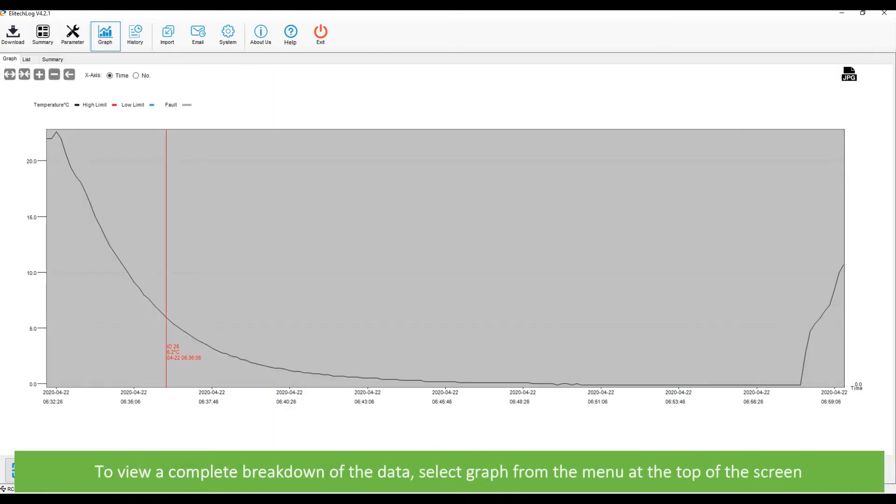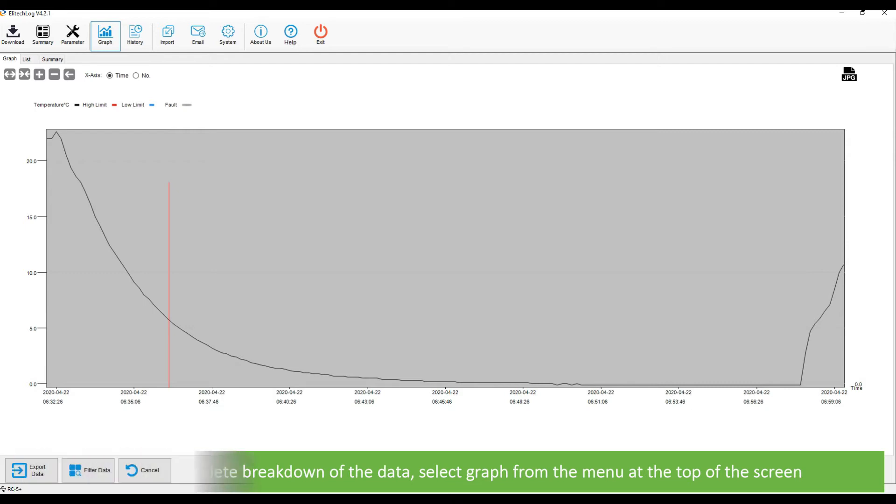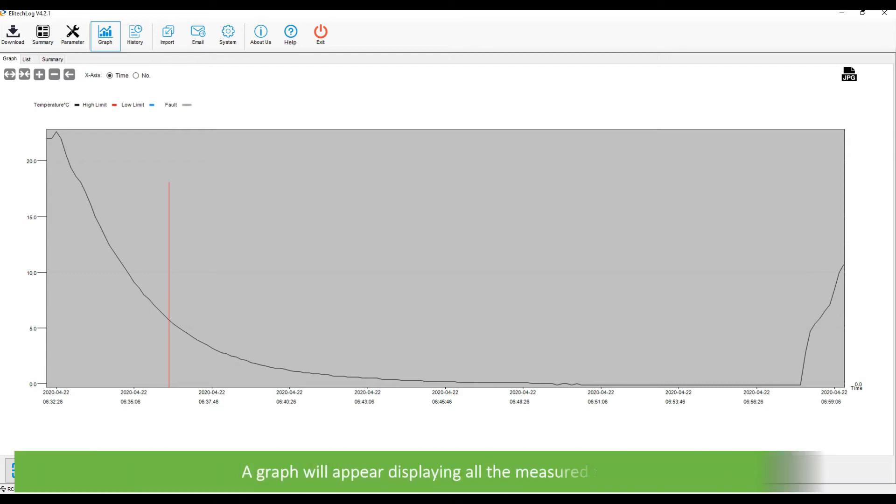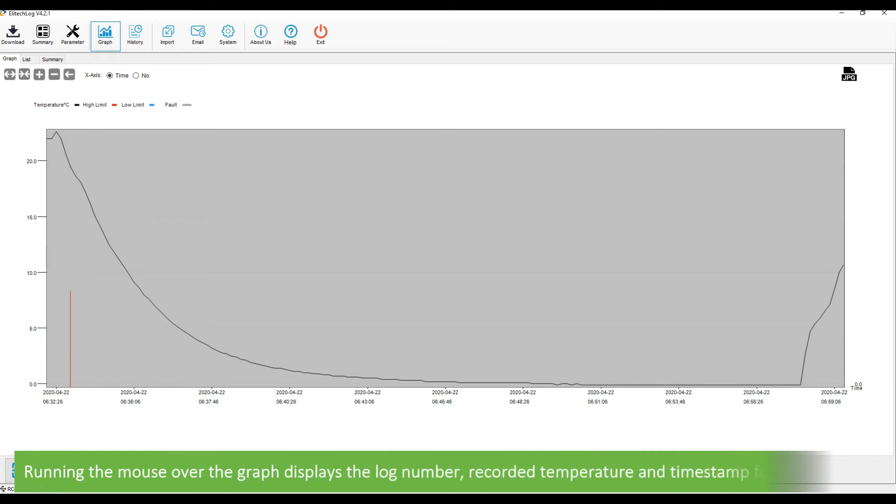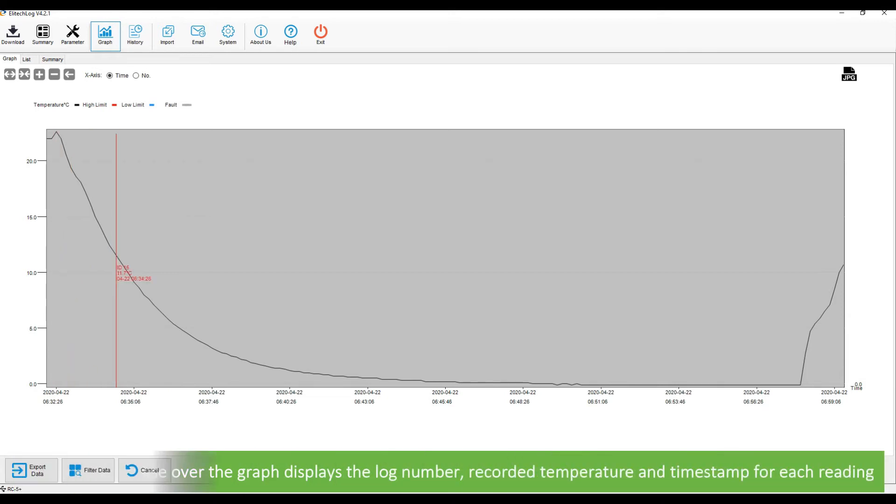To view a complete breakdown of the data, select graph from the menu at the top of the screen. A graph will appear displaying all the measured readings. Running the mouse over the graph displays the log number, recorded temperature, and timestamp for each reading.